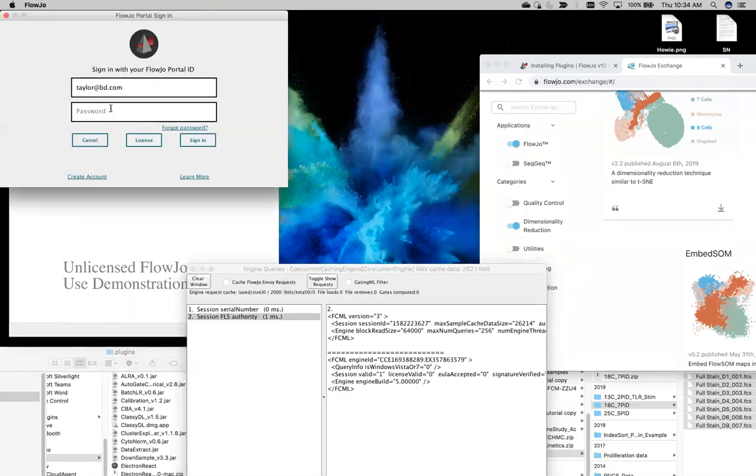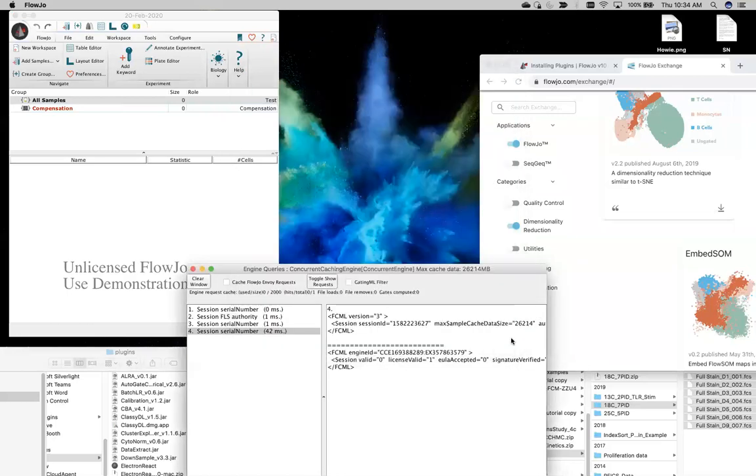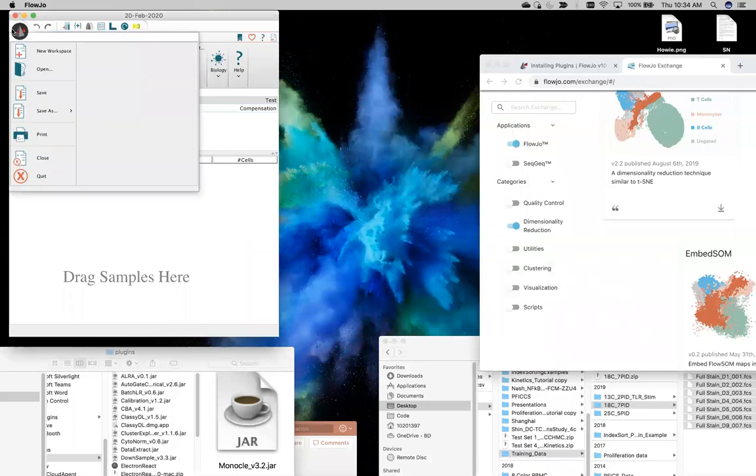So that's a great question. You definitely should not need to rerun calculations just because you upgraded your R.